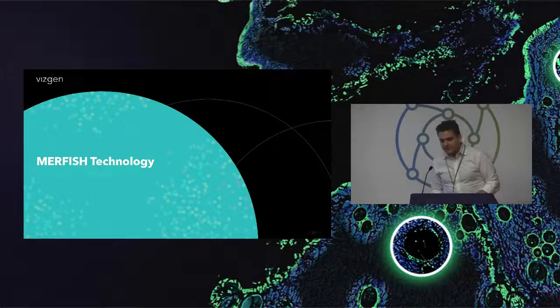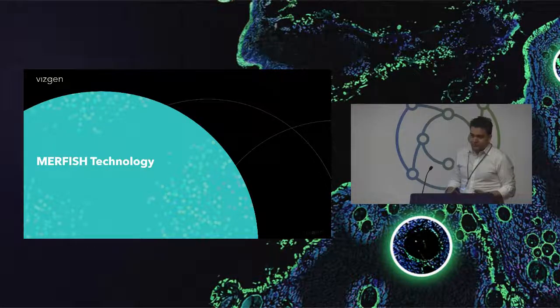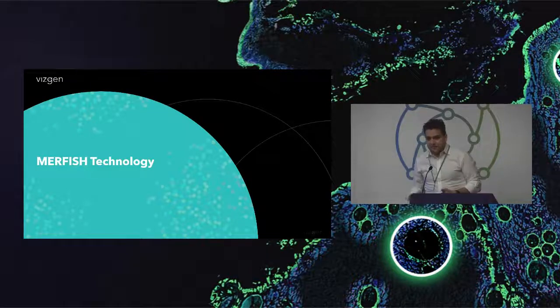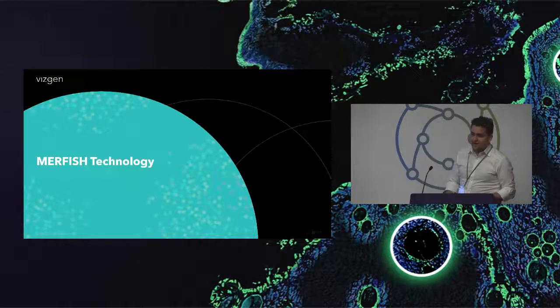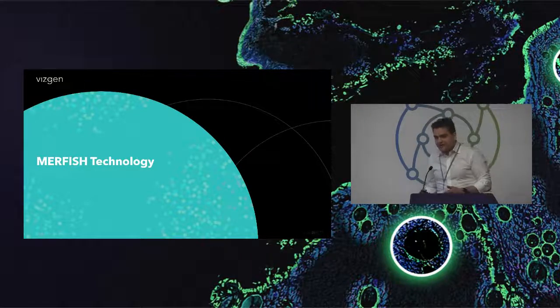So today I'll focus the talk around three main aspects. First, I'll introduce MERFISH technology, so you know exactly how this instrumentation and this platform is working, how we're doing this very highly multiplexed spatial transcriptomics measurement. From there, I'll briefly discuss the workflow, how it looks to run a sample through the platform, all the way from gene panel design through getting the data out the other side. And then I'll finish up by discussing how we're continuing to expand the capabilities of this platform, in particular how we're expanding the different sample types that it can work on, from fresh frozen to FFPE tissues as well. So I'll share how some of that data looks as we work to launch that capability later this summer.